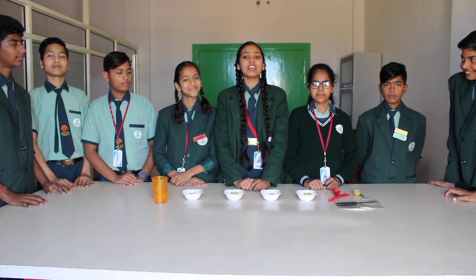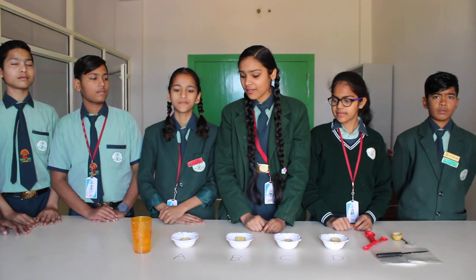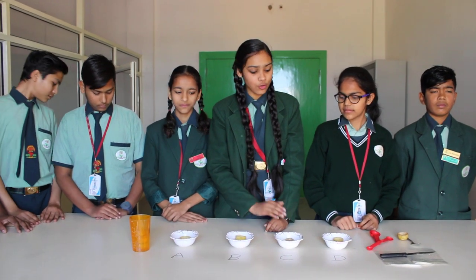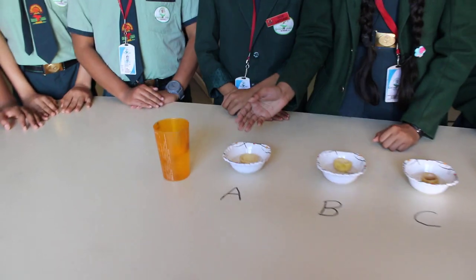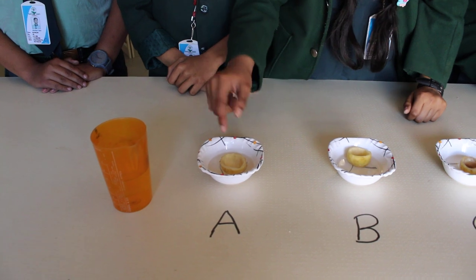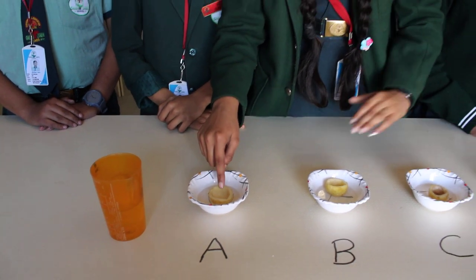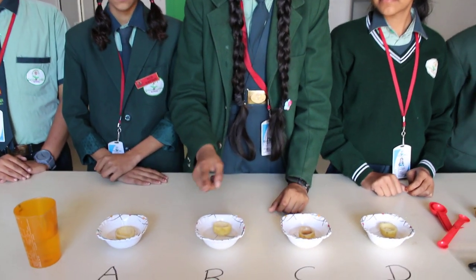We had kept these for two to three hours. Now we will observe what happens in each potato cup. In potato cup A, nothing happened — no process, no osmosis is going on. We had taken it empty and now it is still empty.